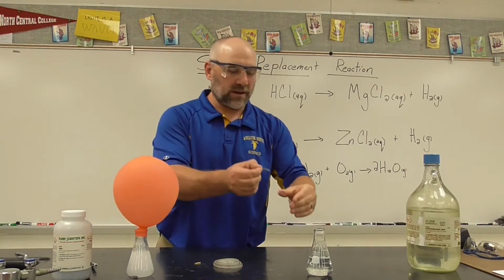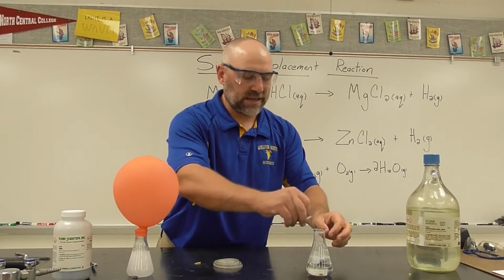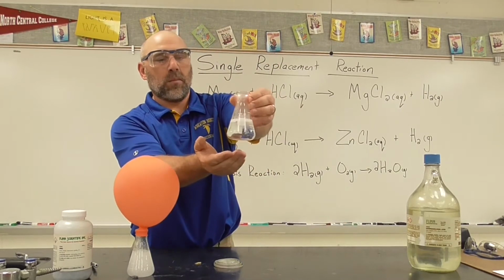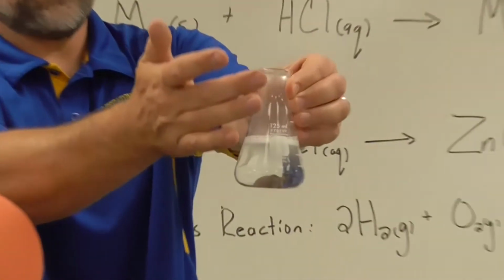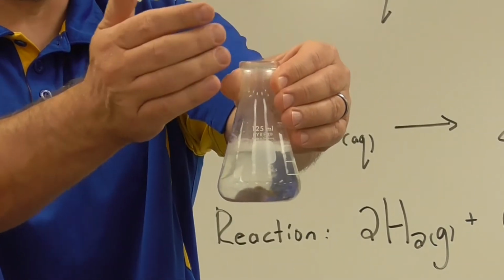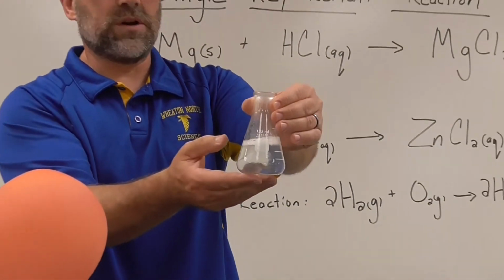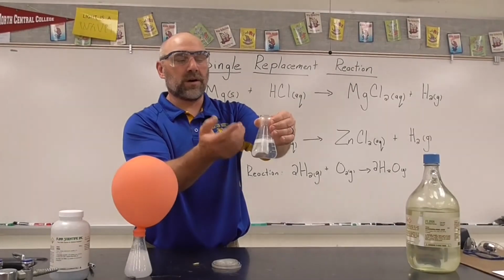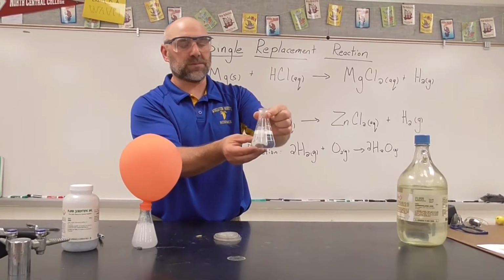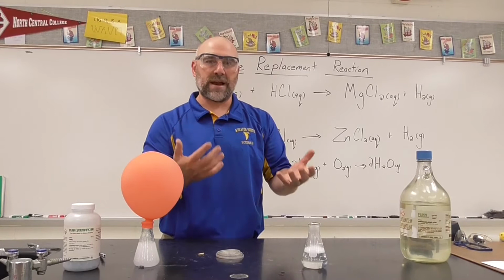So I'm going to add these to the container now, and what you can hear and see is the production of that hydrogen gas. You can see the bubbling that's occurring, and you can see some vapor coming out at the top as well. That vapor may actually be some water vapor as well, because this is an exothermic reaction, meaning it's producing heat, which could be vaporizing some of the water that's in this mixture. It's actually getting warm to my fingers to touch it at this point. So I'm going to set it back down, but this is a single replacement reaction.